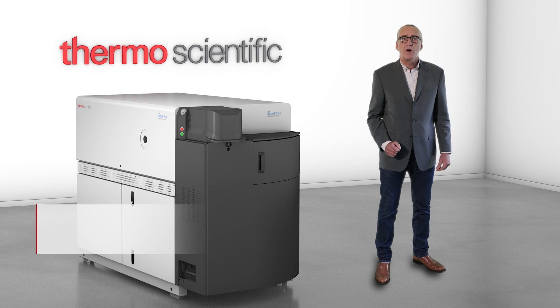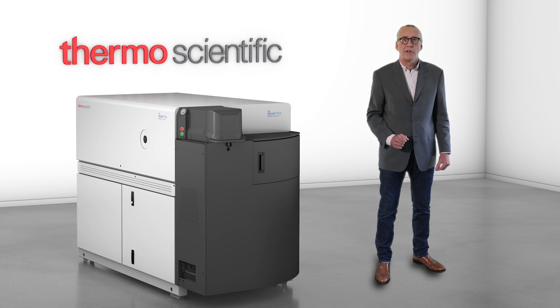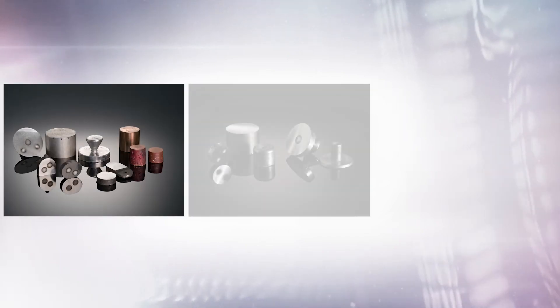Thermo Fisher Scientific proudly presents the ARL iSpark Plus Metal Analyzer, the next generation of the trusted standard in spark optical emission spectrometry, streamlining your laboratory workflow by taking speed and stability to the next level.